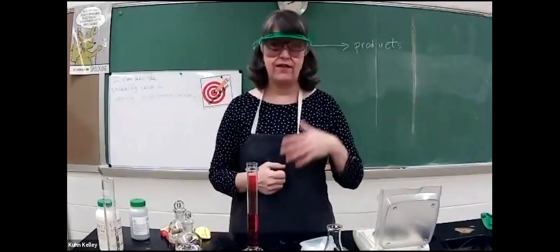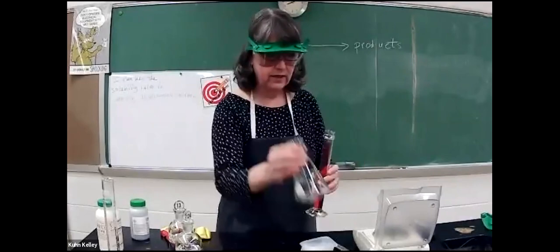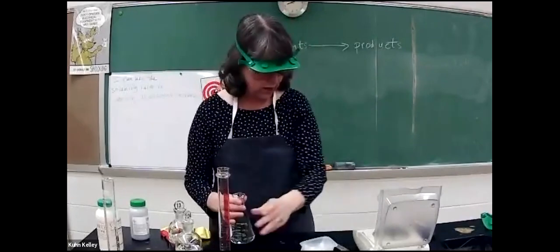And what I mean by that is the reaction part is going to react whether I have a little too much of one or the other, but I am doing measurement. So I'm going to put that into my Erlenmeyer flask, and I'm going to get it to mass. That was my step one.